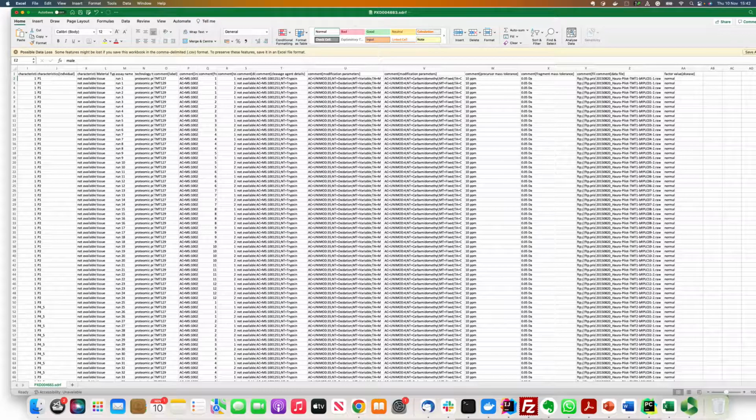I hope this has been helpful, and you can go to the first talk to see how SDRF is coupled to Quantms. Thank you.